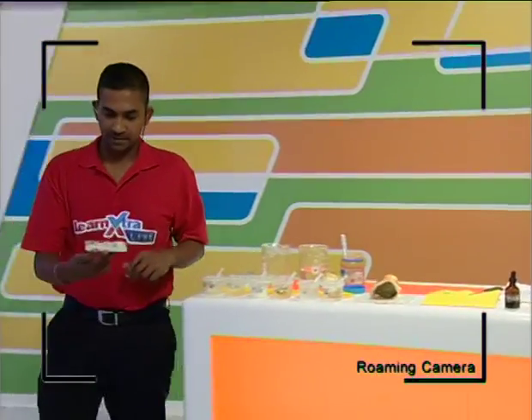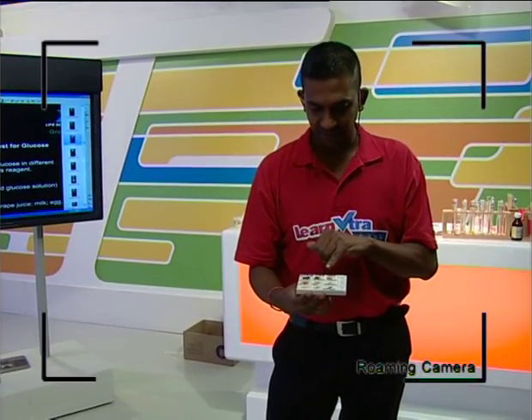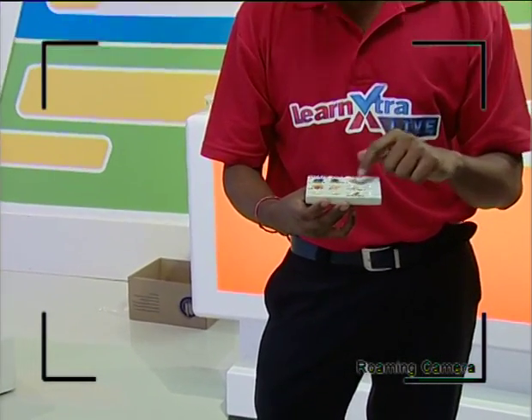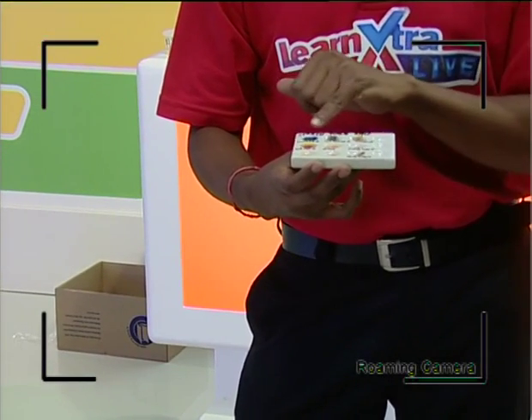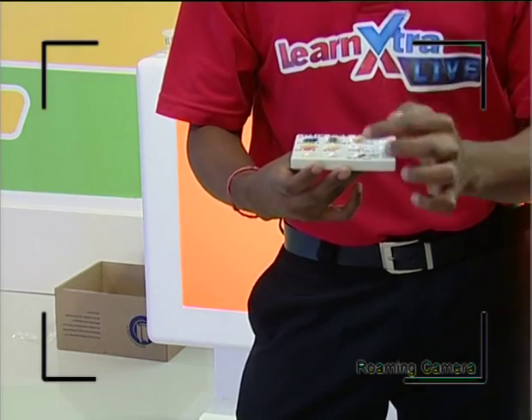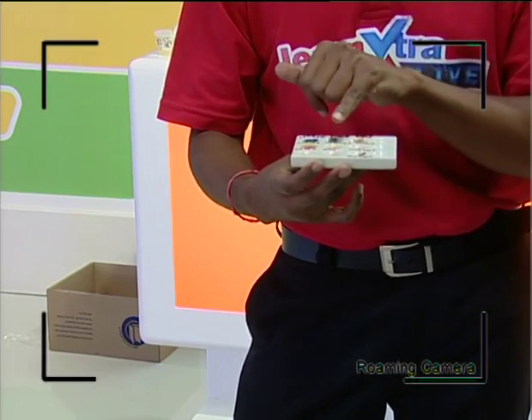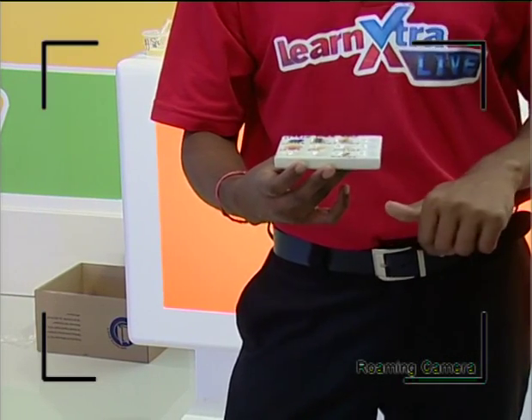Right here in front of me, guys, we've got starch, potatoes, apples, water, glucose, amino acids. And if you look carefully, you see the peanut butter has turned black, the onions have got some spots of black, the apple also contains starch. Here's the potato, which tested positive. So of these samples, peanut butter contains starch, your onions contain starch, apples a bit of starch, potatoes definitely tested positive, glucose does not contain starch, your eggs do not contain starch, and your grape do not contain starch.